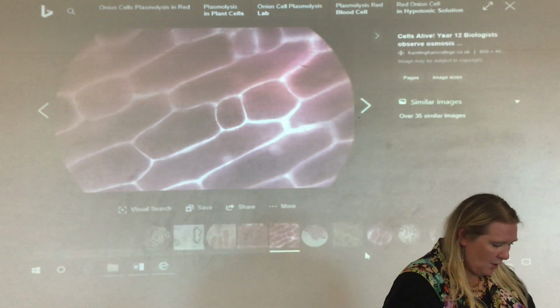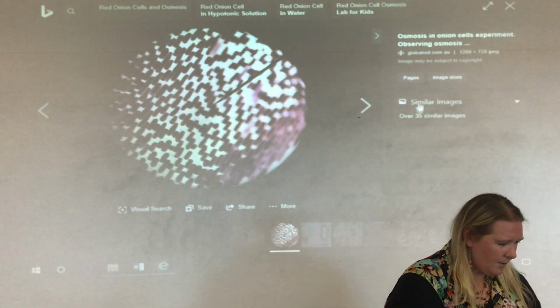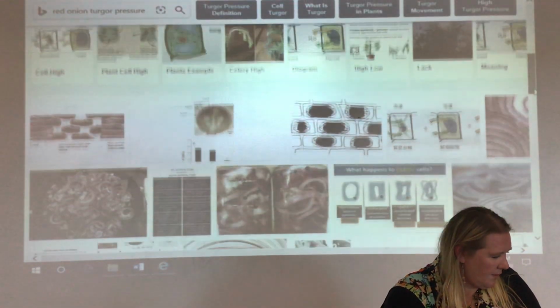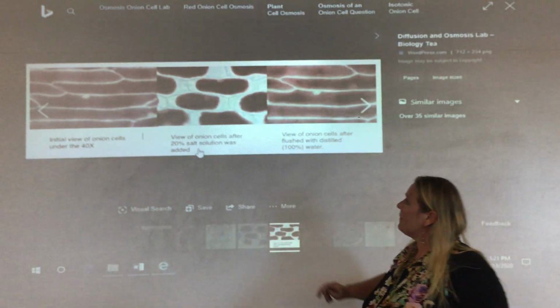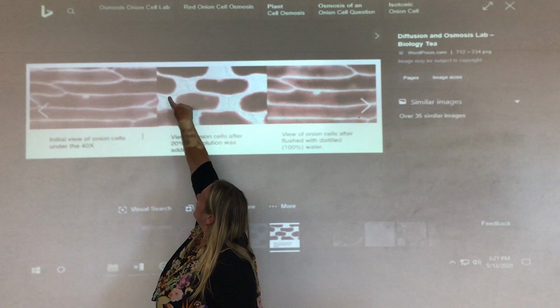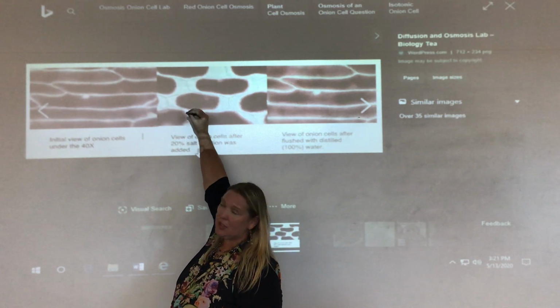And if I go to this one, it's not pushing against those edges.